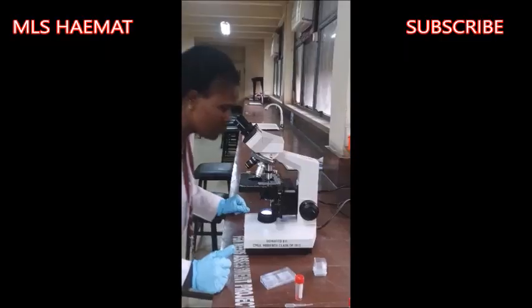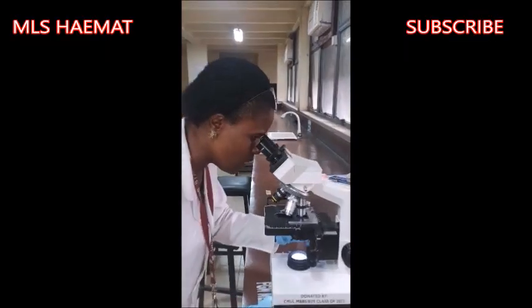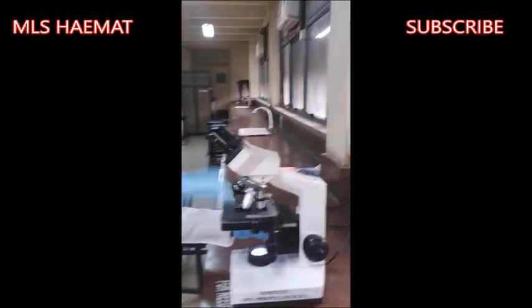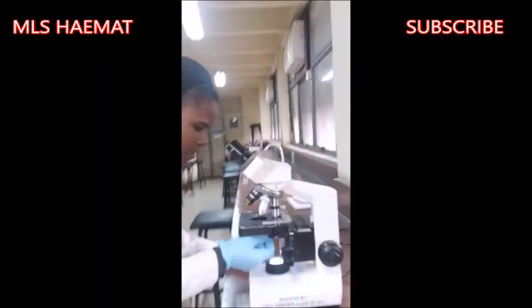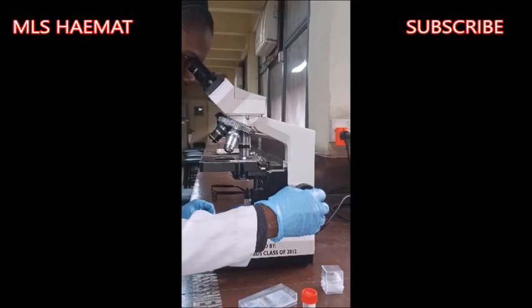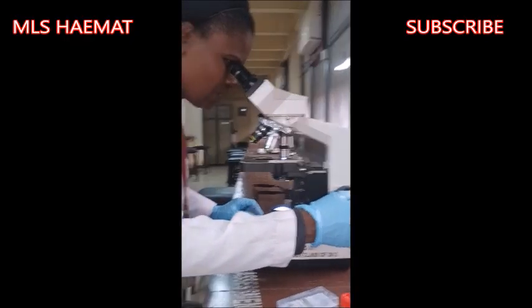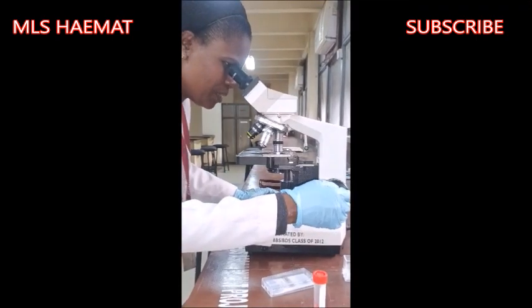So I've changed it to the times 100 objective lens. In this case, I'm going to raise the condenser and then open the diaphragm. I've opened the diaphragm now. So all I need to do is just move the fine adjustment forward just a little, and then I have it. I've already focused.